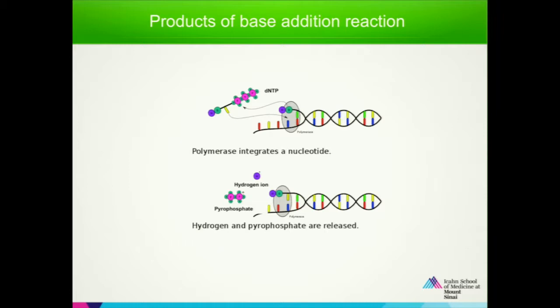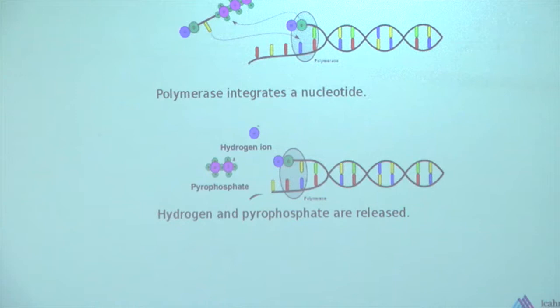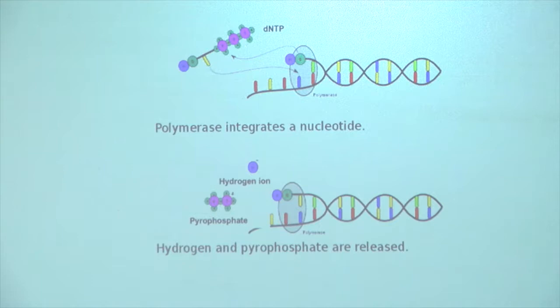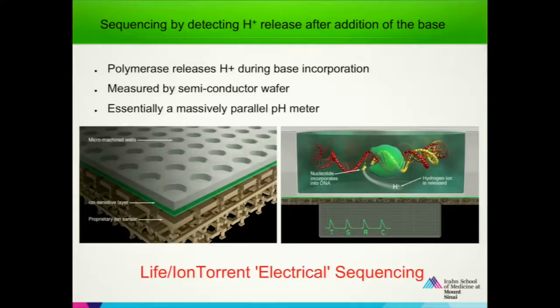The 454 technique, which I explained to you, detected the release of pyrophosphate using that APS, sulfurylase, and then luciferase. Right? And then they developed, in that same well, their own electrochemical detection, which detects the release of that hydrogen ion, the positive charge. And then that records the addition of that particular base. What is important here is that there is no need of any cameras, okay? So it becomes cheaper and faster, right? That's how you get signals. So this was cool.